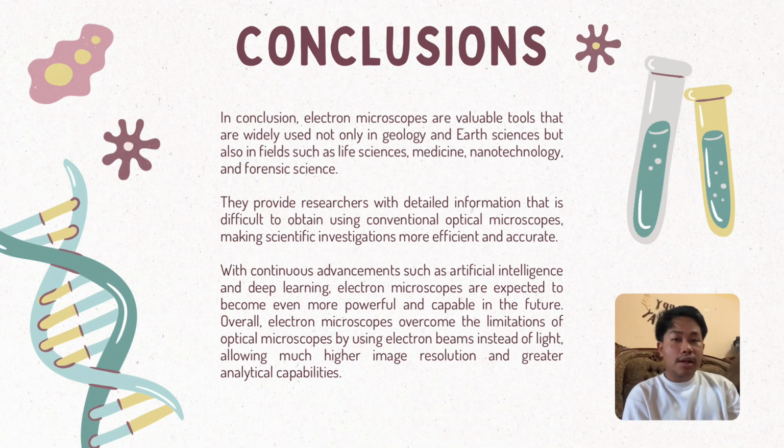In conclusion, electron microscopy is an essential tool in geology and many other scientific fields. It provides detailed images that are impossible to obtain using a conventional optical microscope, helping researchers make more accurate observations and discoveries.